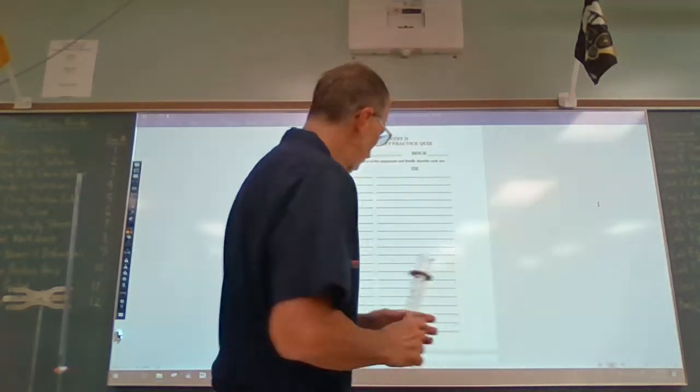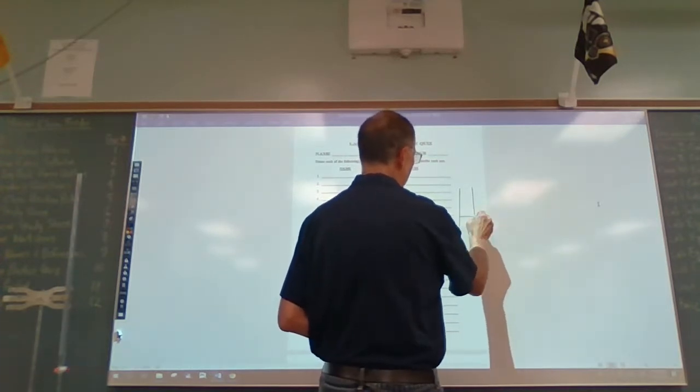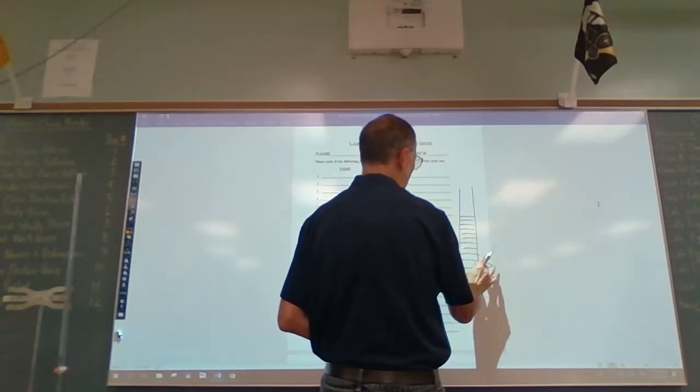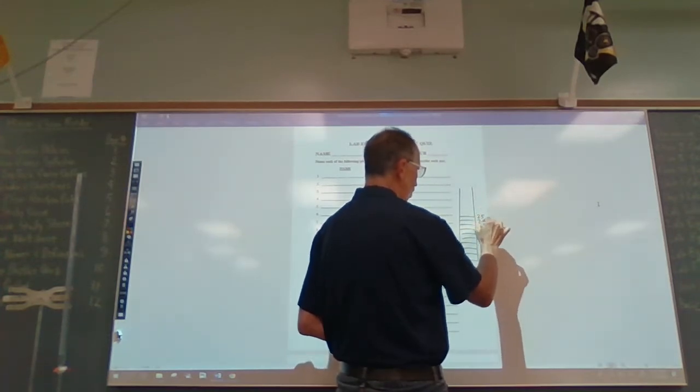Now, let me draw a quick picture of the graduated cylinder here. So here we go. Let's say this is 25 mLs and this is 24.